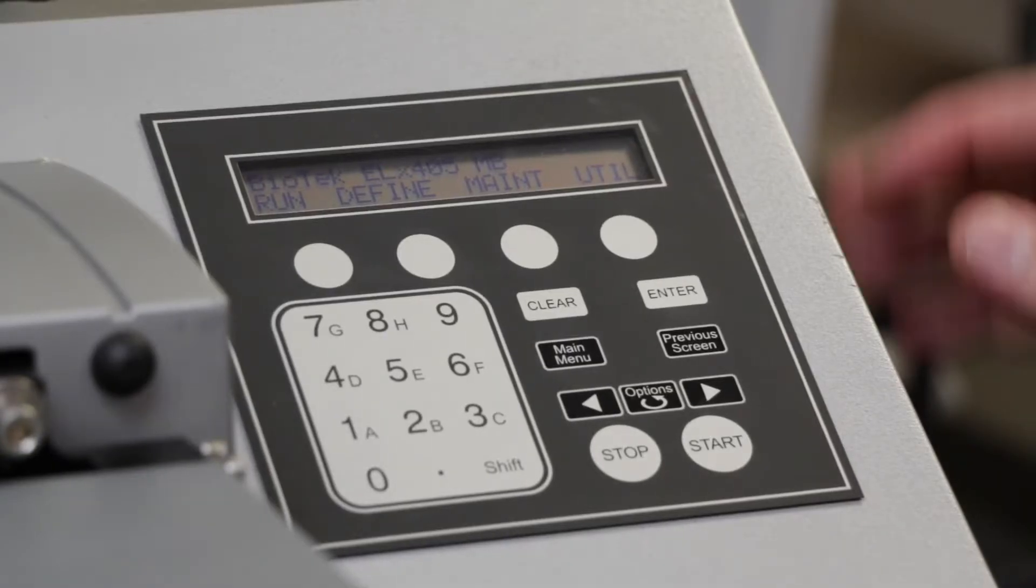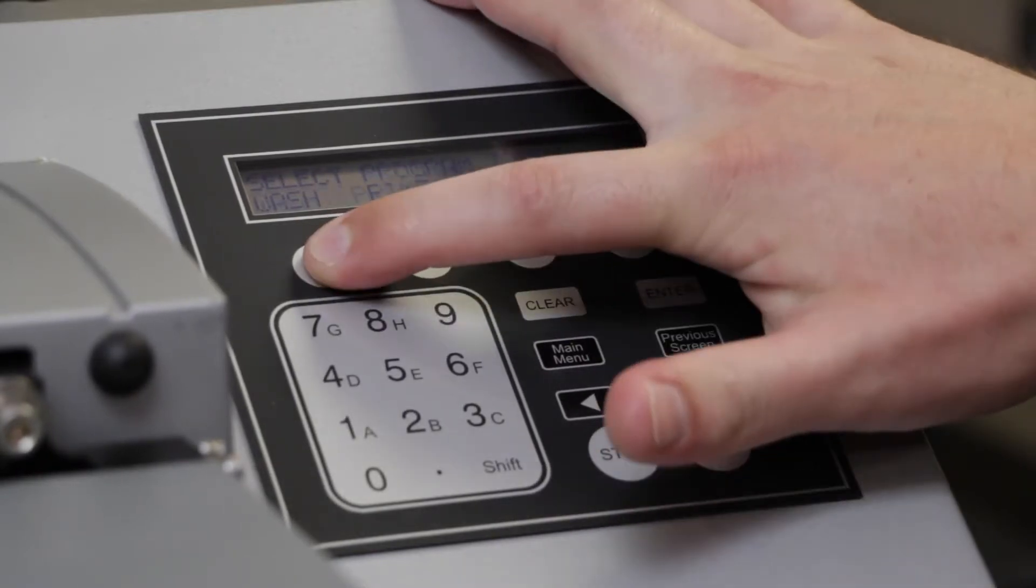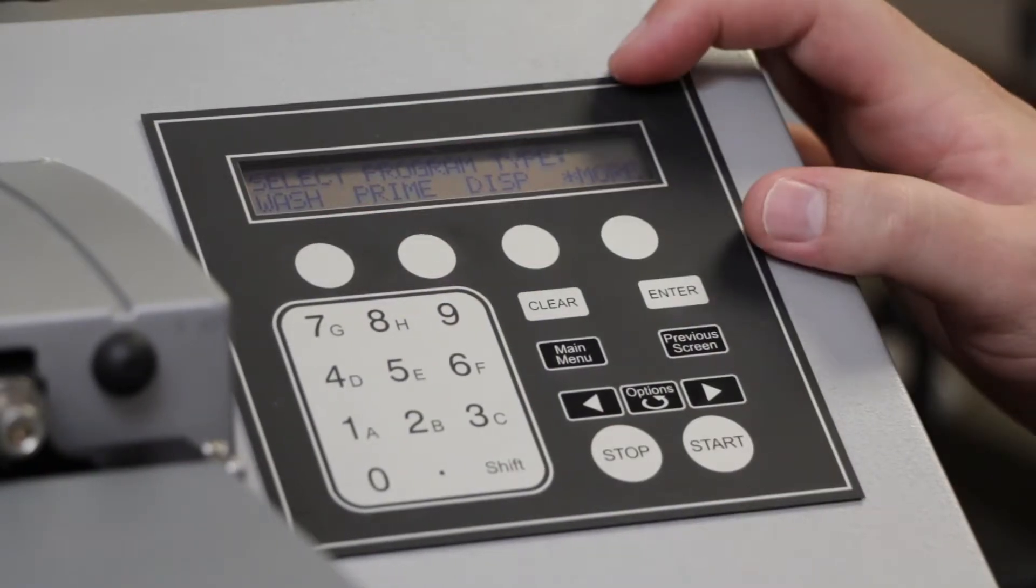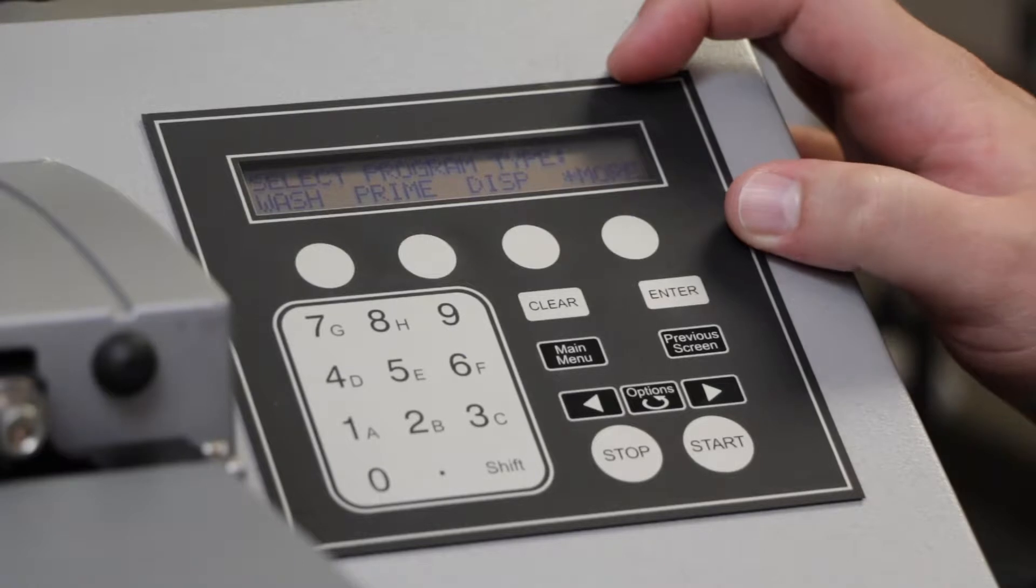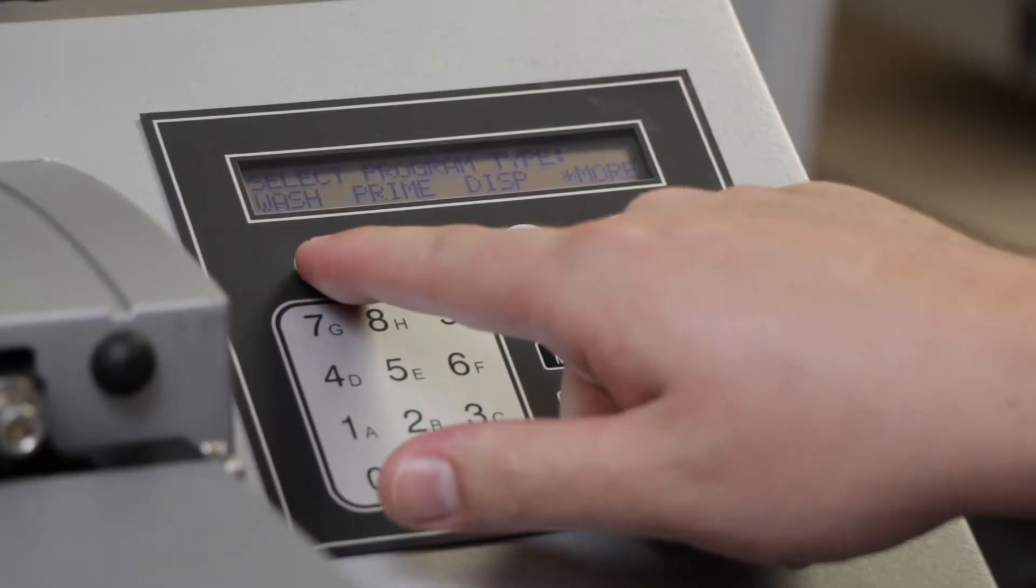To create a wash protocol, first open the Define menu, and here select Create. Once you're at this menu, you can select which specific aspects you want to create. In this case, we're going to be making a wash protocol, so we'll select the wash option.